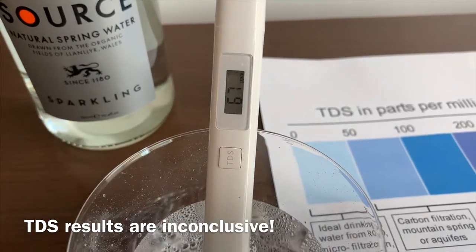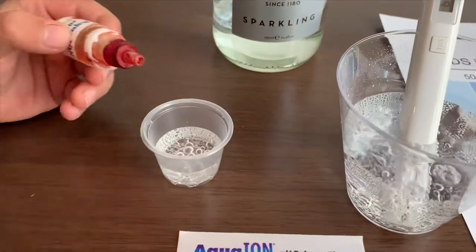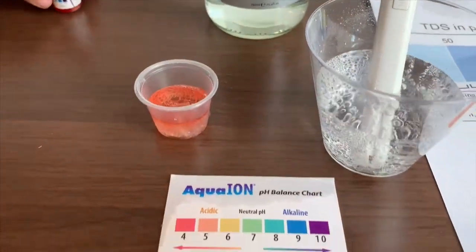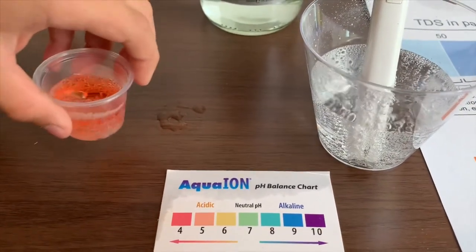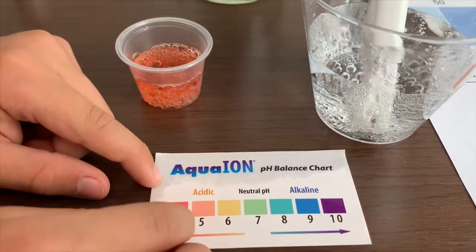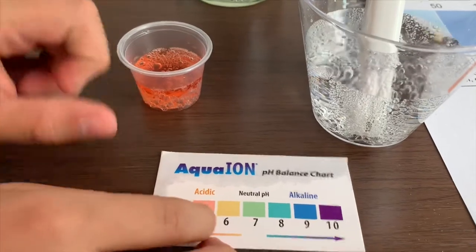This is below average tap water. Now let's test the pH level. Let me do two drops. This is a red — that means it is very acidic, at 4.5.